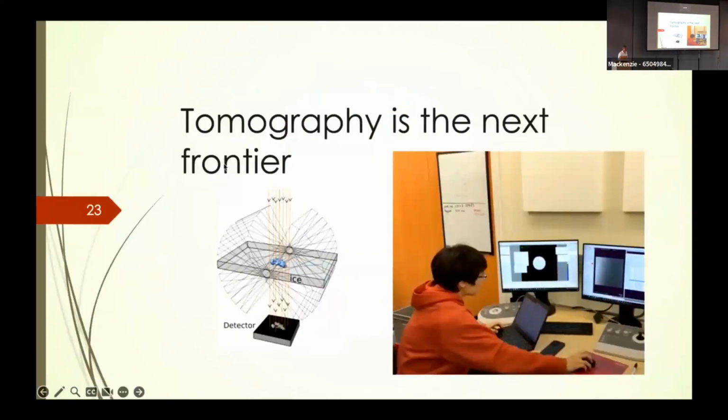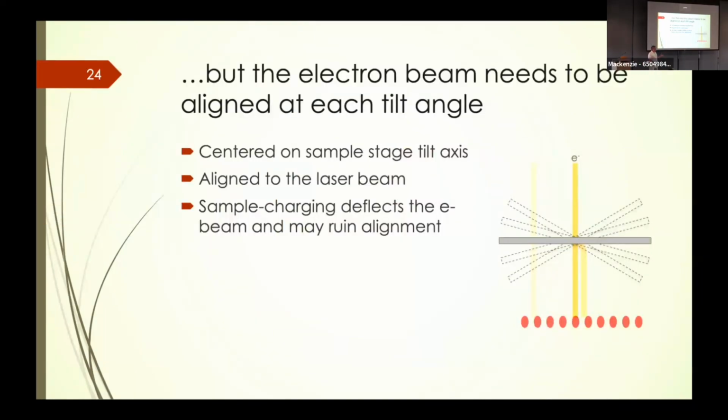And then we also set out to take a tomogram. Now, what's so cool about a tomogram? A tomogram shows you how the particles interact inside their native cellular environment. So you cannot just see the structure of this molecule, but you can see these molecules are always found close to the other molecules, or these molecules get distorted if they interact with these other molecules.